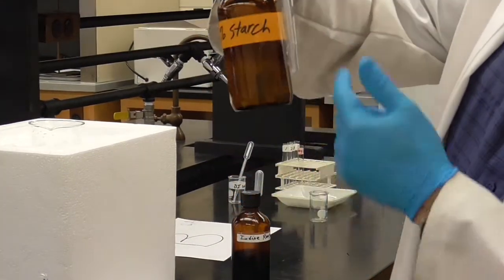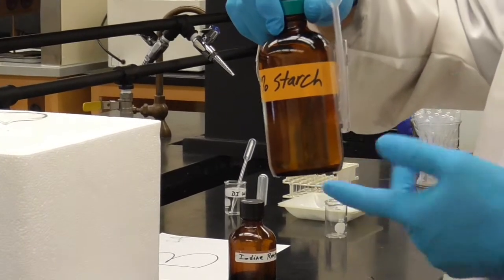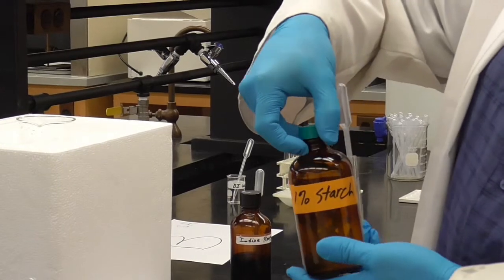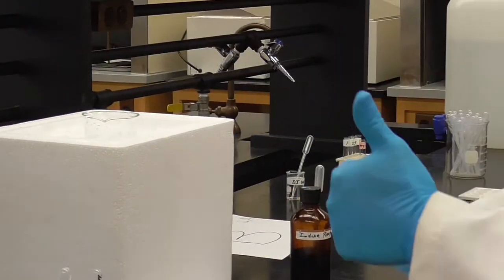Okay. In here, it's not really breaking down yet because it's a very slow reaction. There's water in there, there's starch, but it doesn't break down because it's really, really slow. But if I add the catalyst to it, then it breaks down very quickly. All right, so we've got that.